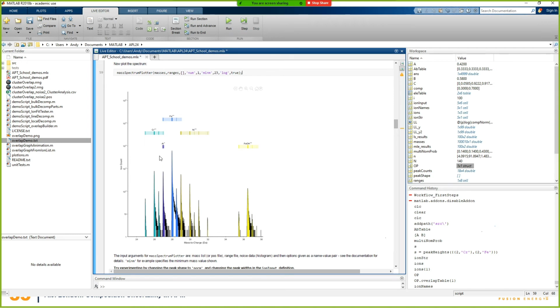So we get the colored ranges in the mass spectrum as you'd expect, and then it's got these labels above it. I tried putting the labels on the individual peaks. I found that annoying, and then I was frustrated that I didn't have the natural abundance information. So I came up with this. I looked at a whole bunch of different mass spectra in the literature, not in atom probe, but in other fields.